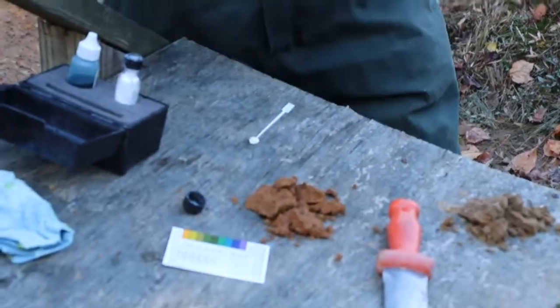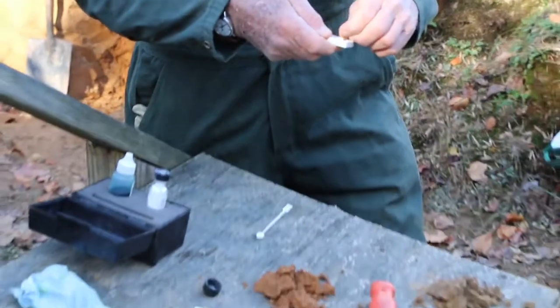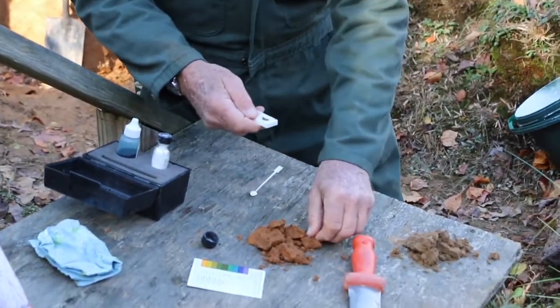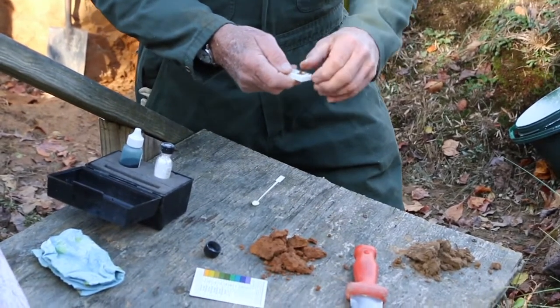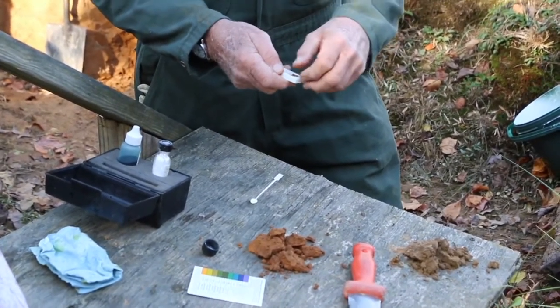Take just a small pinch of the soil material itself — in this case the subsoil. Generally, I try to fill about a third of the cavity.